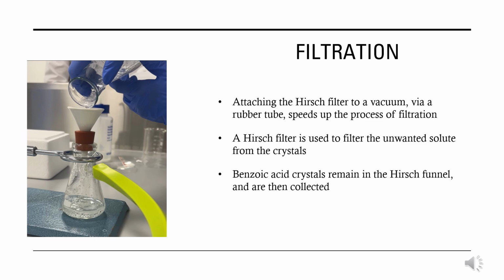Filtration is used to separate insoluble particles from the solution, and in this case of the experiment we had benzoic acid crystals, for which we used a Hirsch filter, and then we attached that to a vacuum to help pull the solution through. And then the solution went through the Hirsch funnel and we were left with benzoic acid crystals on the top.